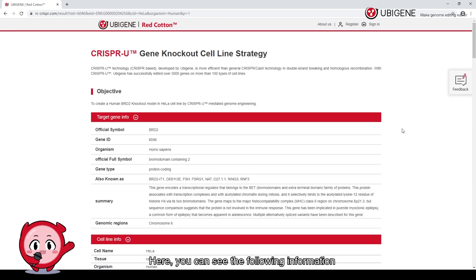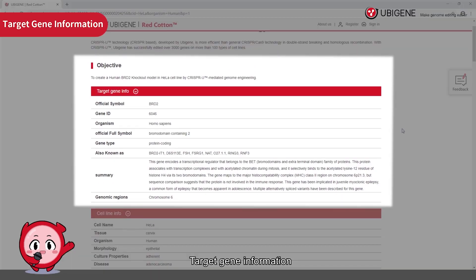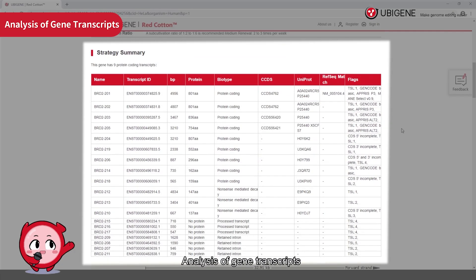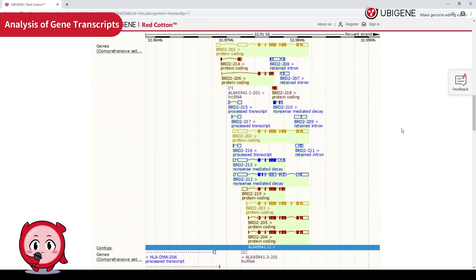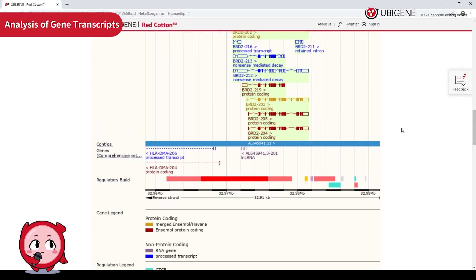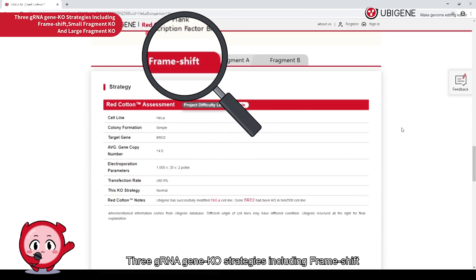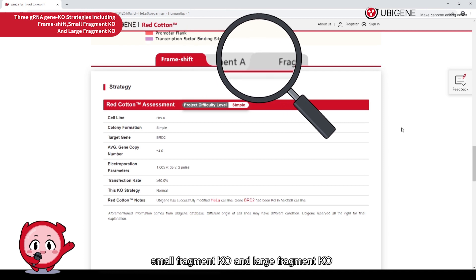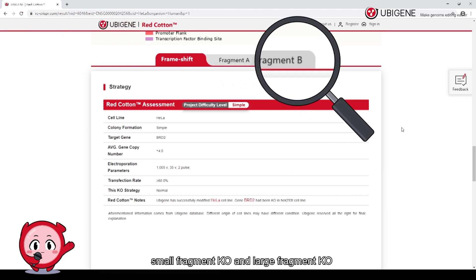Here you can see the following information: target gene information, cell line information, and analysis of gene transcripts. Three gRNA gene knockout strategies are provided, including frame-shift, small fragment knockout and large fragment knockout.